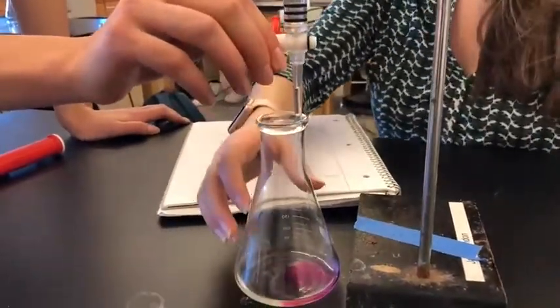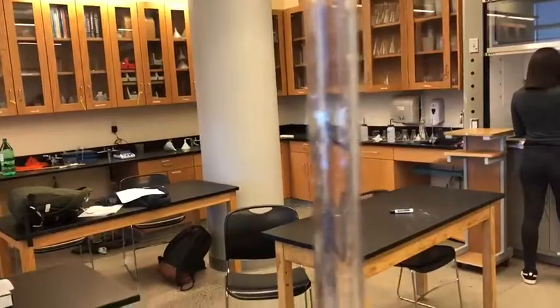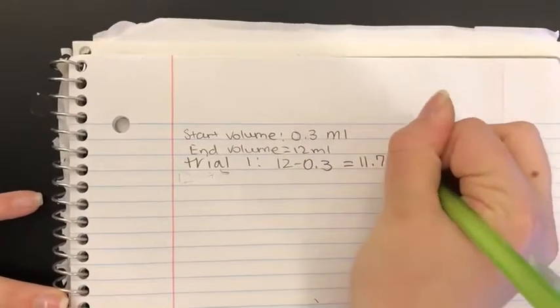Step 9. When you complete the titration, you will subtract the starting volume from the final volume to determine the amount of solution you have added. Read the volume from the bottom of the meniscus.